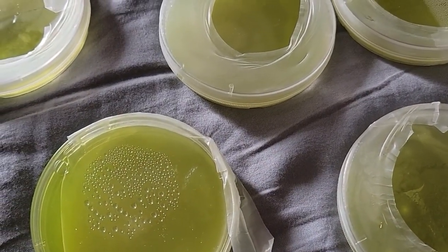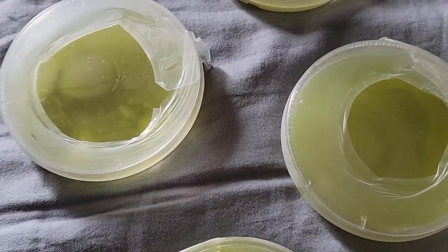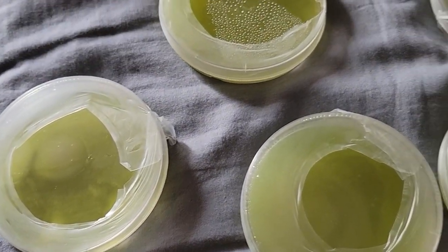Alright, so here they are just a few days later on April 18th. As you can see, they're all contaminated.